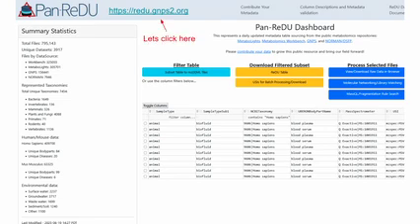Okay, great. So afterwards, just go to this slide and click on the Redo link, or just type it into your browser. Here on the upper, does this actually work too? Ah, yeah. Up here. Is anyone still trying to get there and not there yet? No. Okay, great. So this dashboard that you're seeing here, that's the Redo dashboard.